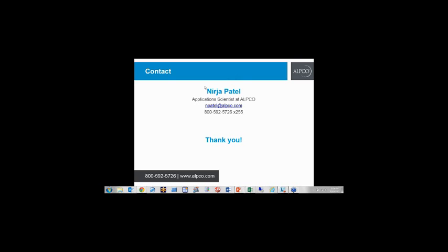The next question is, how well do these antibodies stand up to fixation if not used for sorting? That's a good question. What we routinely stain with is acetone for immunohistochemical purposes. So if you're interested in doing immunohistochemistry, we know that the reagents will work with acetone. Some of them may work with paraformaldehyde or formalin fixation, but we really haven't validated that.